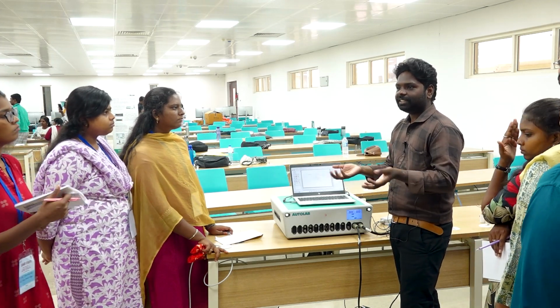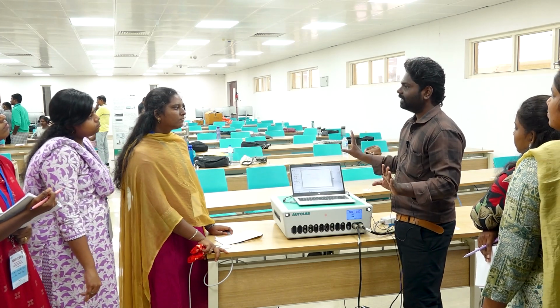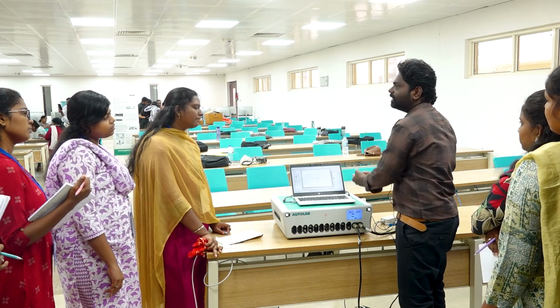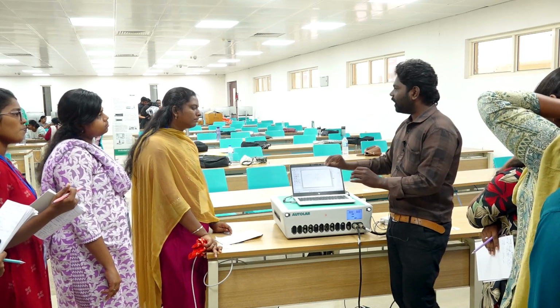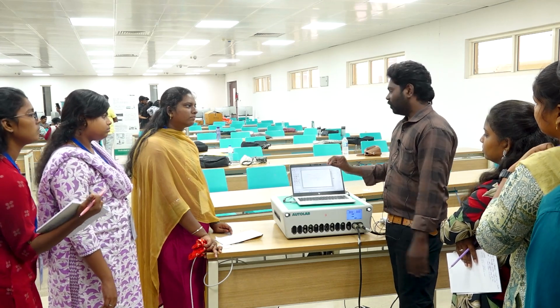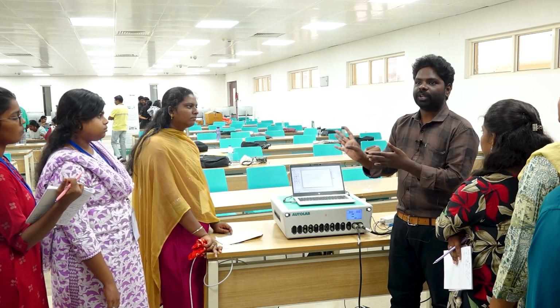Getting data is very easy. We can simply connect the sample and press one run button. That's it. After getting the data, the interpretation is what? We have to create an equivalent circuit. Then only we can get the exact values. So without drawing the equivalent circuit, we won't get any values. So for that, we need to know how to draw a circuit.